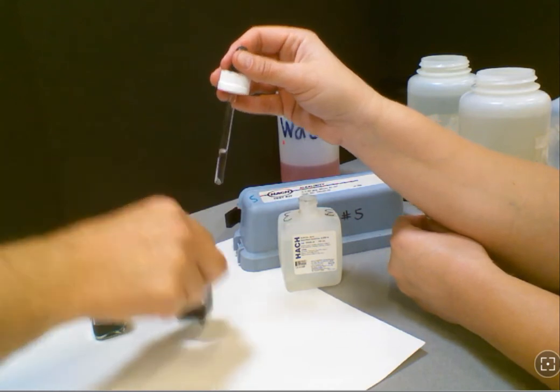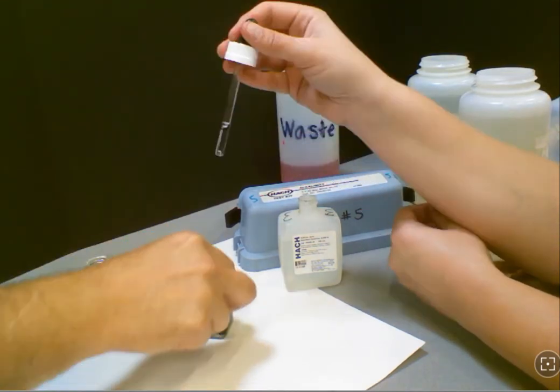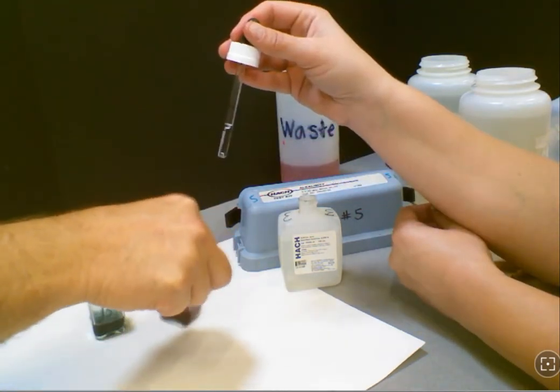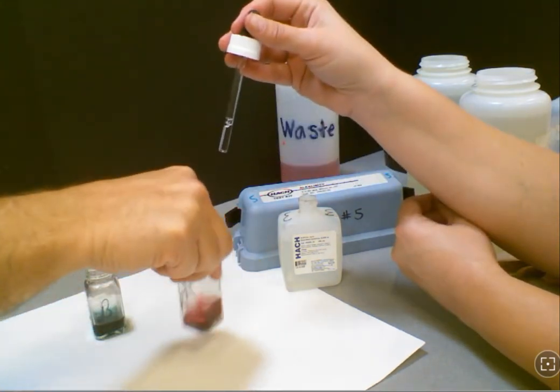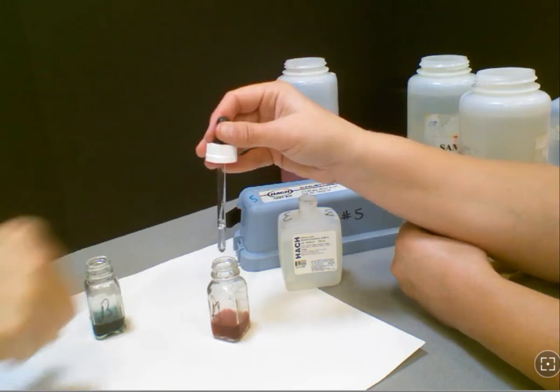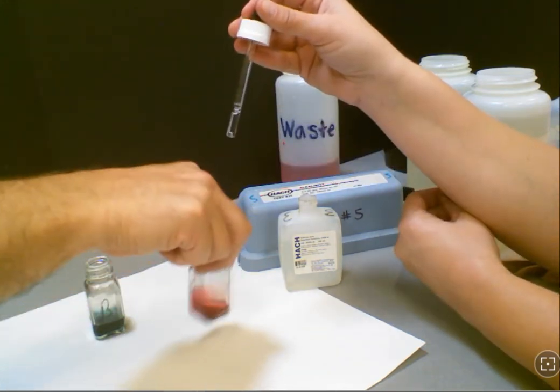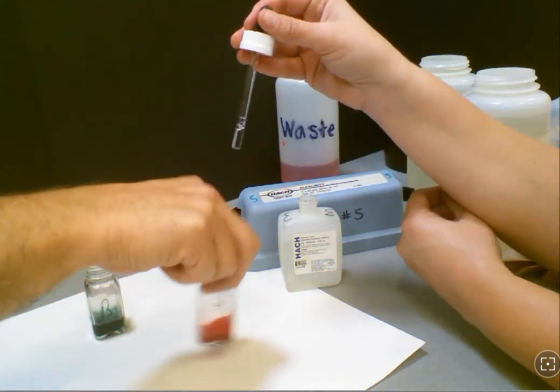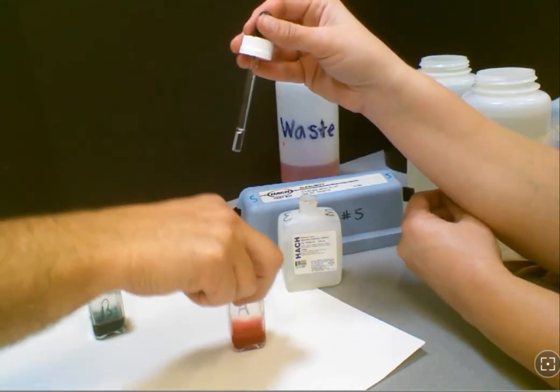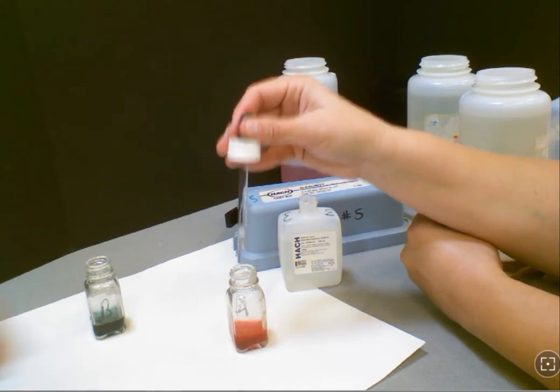The goal here is to titrate, and that is you're looking for a color change until it stops changing shades of pink. It's going to move through several color changes, as you can see on this video. And once you get to the very end, the very last drop that causes it to stop changing, that's the number you want. If you feel you've gone too far and you've added two drops and it stayed the same color, please subtract that drop from your total.